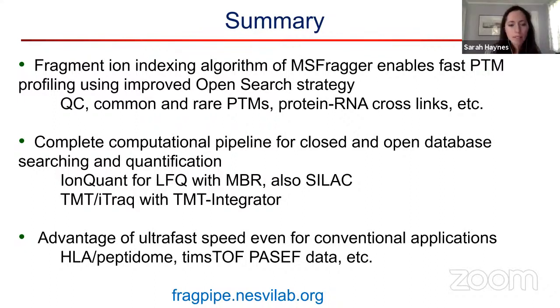So I think that's probably good for discussion for now. Maybe we can move on into the live demos.